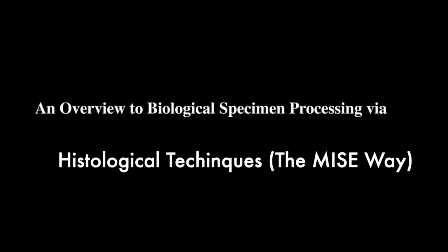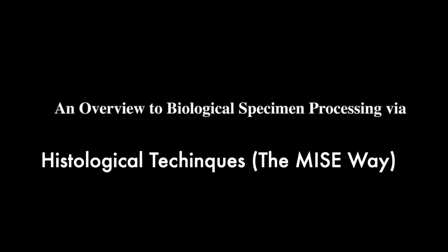An overview to biological specimen processing using histological techniques. The Mise way!